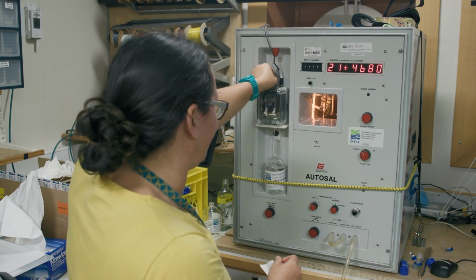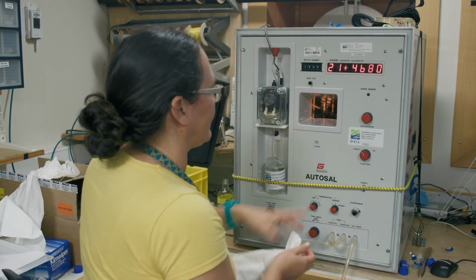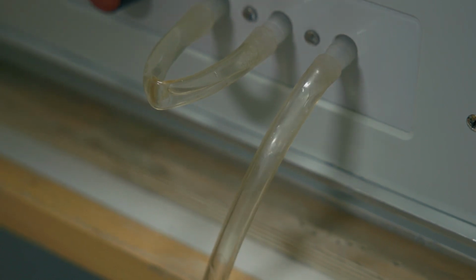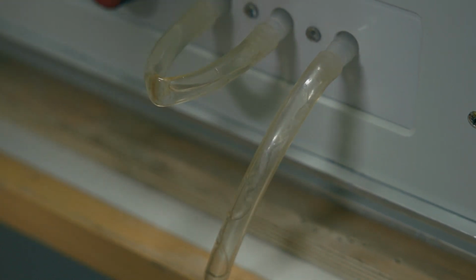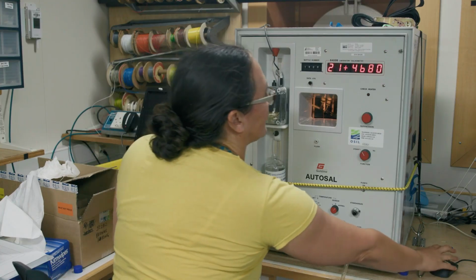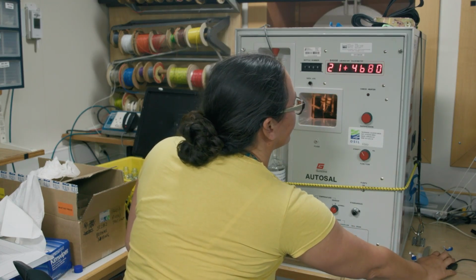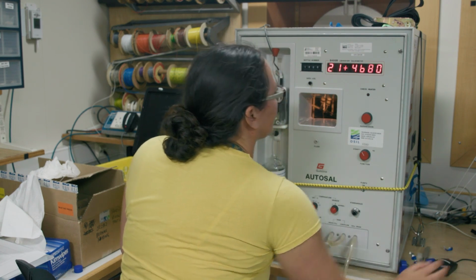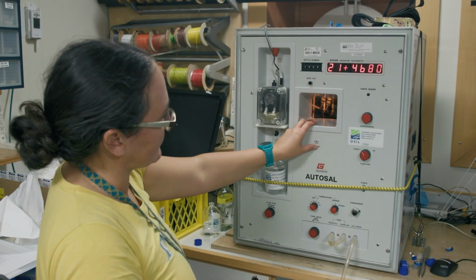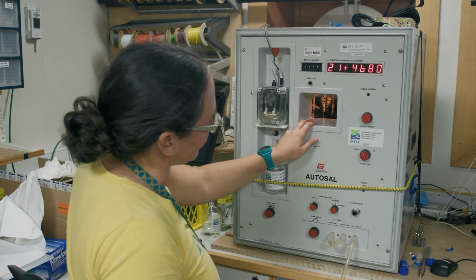Now turn on the peristaltic pump to the middle speed. Cover the flush valve with a finger. This causes the water from the cell to drain, you can see here, and let that continue until there's only a trickle. Release the flush valve, and this will allow the cell to refill. Check that the whole cell is filling without leaving a bubble. Now the cell has refilled once.